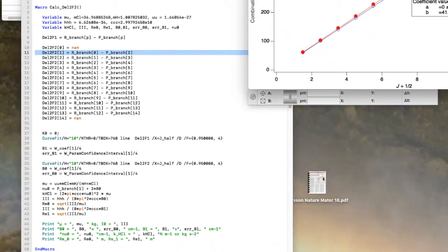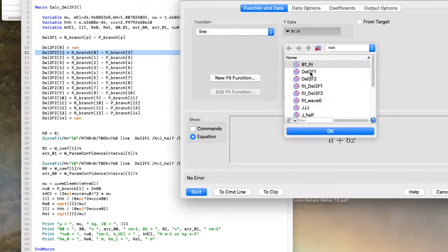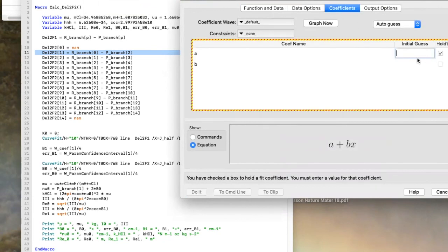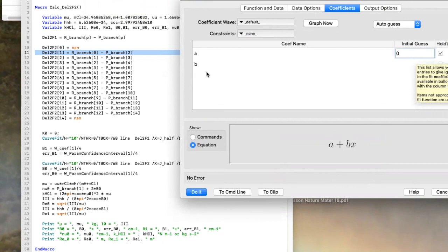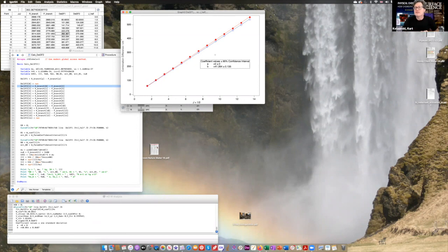We do curve fitting to the combination differences. It's a linear curve fit of the first combination difference versus j plus one-half, and we hold the intercept to zero. We do that — and look at that, we get beautiful fits for the v=0 and v=1 data. That's how I would do it, implementing a bit of Igor. The peak-picking function is quite nice for finding those positions without having to do it all by hand — that's what I'd suggest for you.